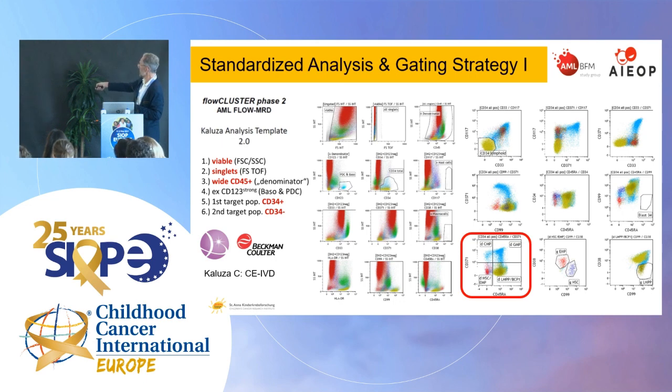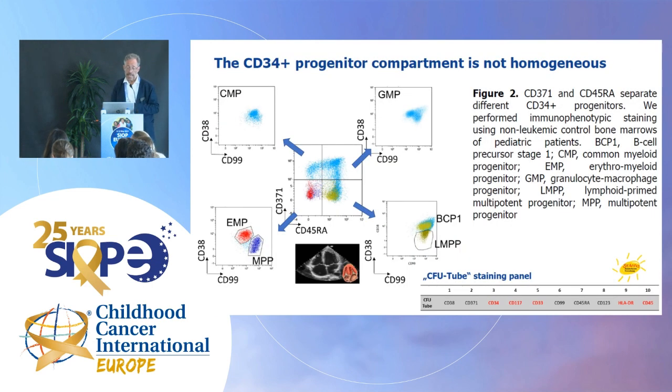Here there is more the lymphatic area. And as said, the early erythroid megakaryocytic precursors coming from here and also from here, and the MPPs, the multipotent precursors, which have in one cell the potential to grow into granulocytes, monocytes, erythrocytes, and dendritic cells.